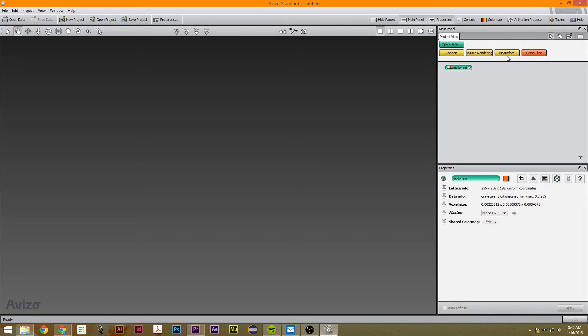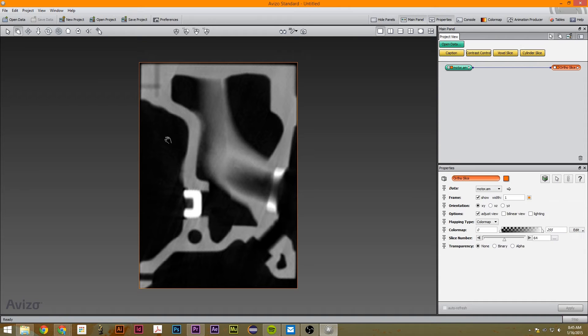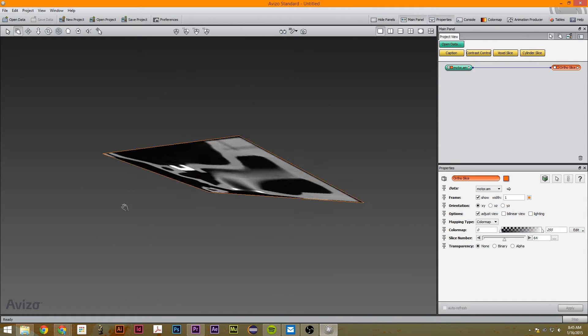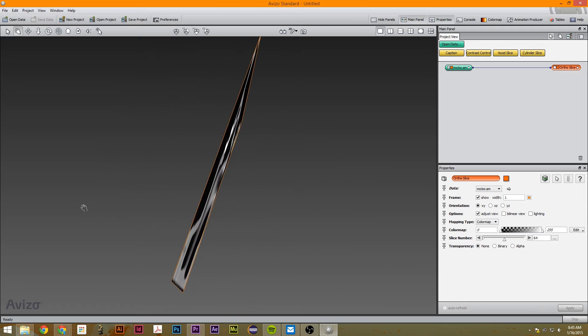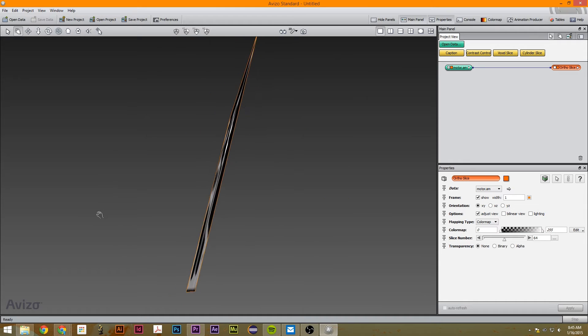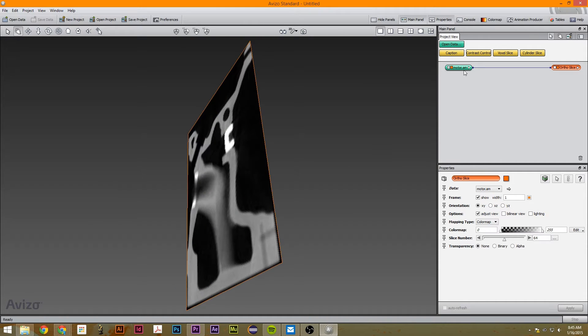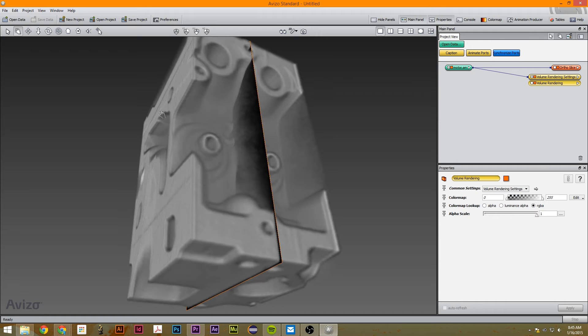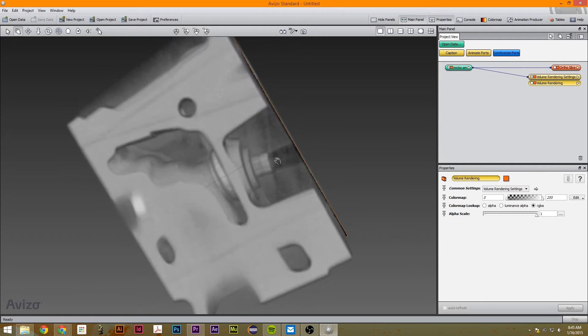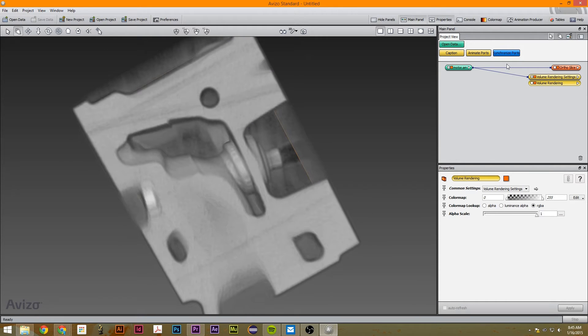The first thing we're going to do is click on orthoslice. So what an orthoslice is, it's basically a slice out of the volume rendering. You can see it in there.